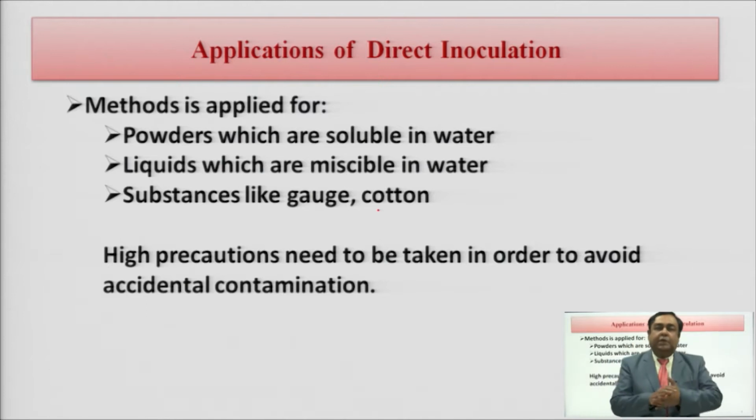That is, you will not be in a position to justify whether the turbidity has been created by the microorganism present in the environment or the microorganism present in the sample.